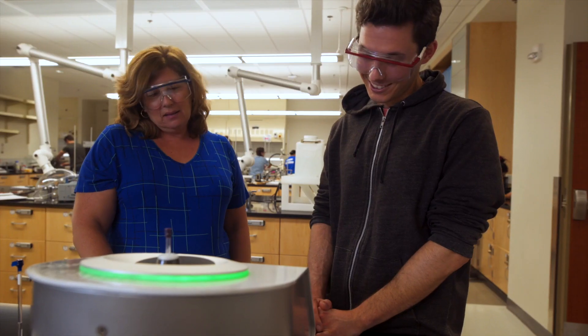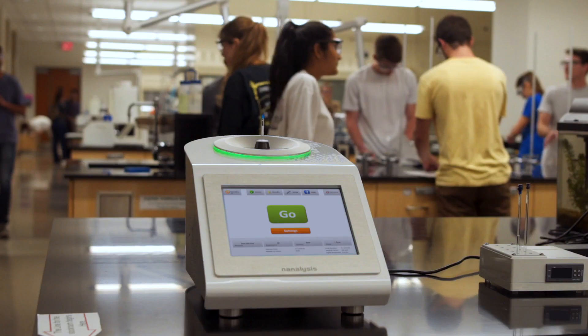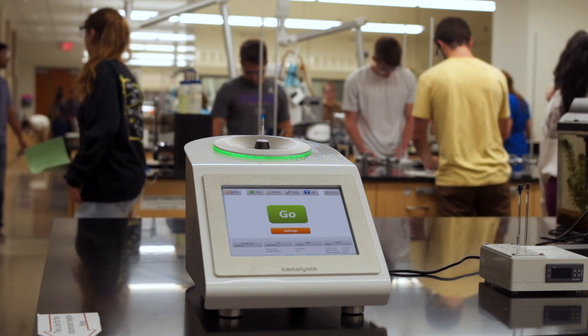One of the other reasons why I'm very happy that we picked Nanalysis is that we've had great support from them. Other than routine shimming, there's really not any maintenance that we have had to do on the instruments at all.